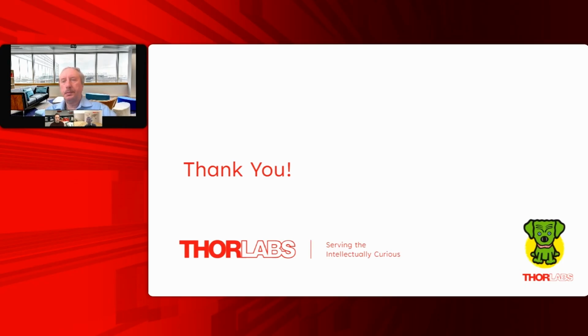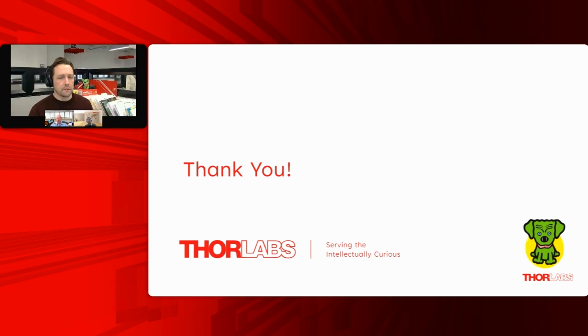And then I see a question about the lifetimes of the supercontinuum laser, and if there are issues with water absorption to the fibers. I can actually answer that quickly. The supercontinuum lasers are in some cases employed in industrial settings where they're running 24 hours a day for various QC processes.